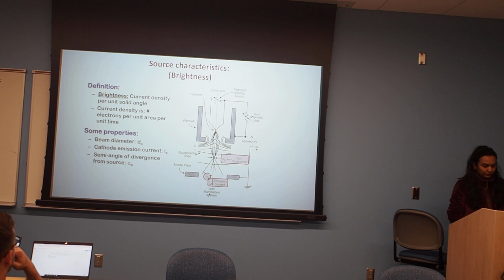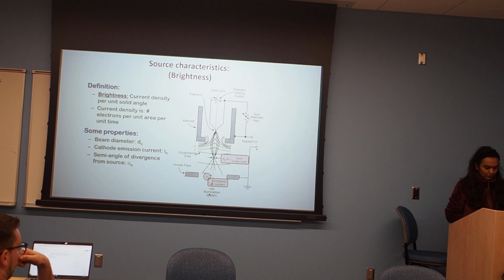Sorry, just on that figure, is 1L, is that the pole piece that it's pointing to? Or which one is that? On the left side where it says 1L? Yes. This is Wehnelt bias. These are all our pole pieces, right? Filament.